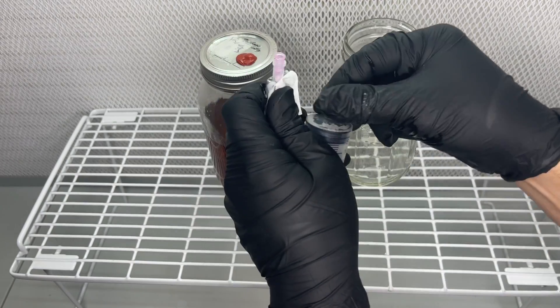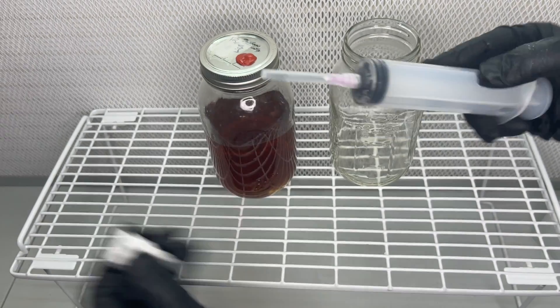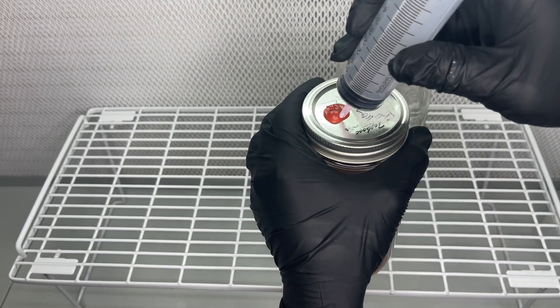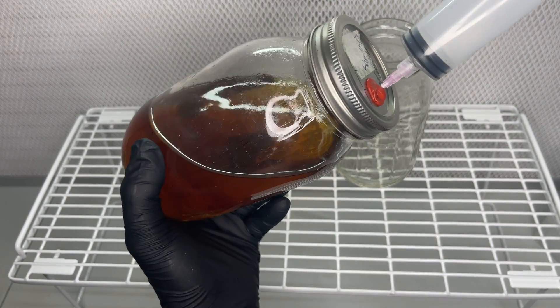I believe the dark color is caused by the mycelium secreting metabolites into the solution. And one of the reasons the metabolites are secreted could be due to running out of nutrients. So in this experiment I use a sterile 60ml syringe and a needle to extract the excess liquid.